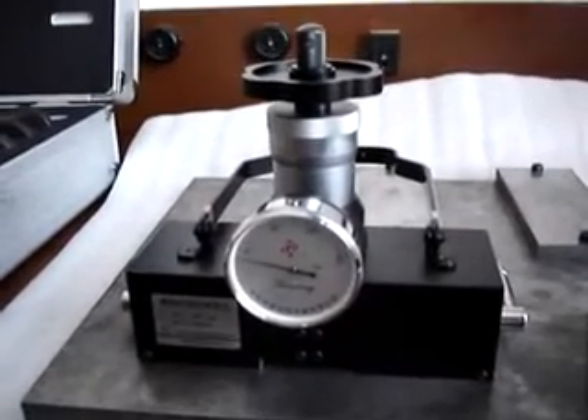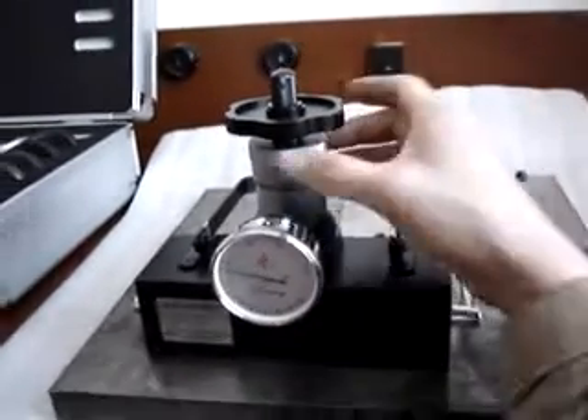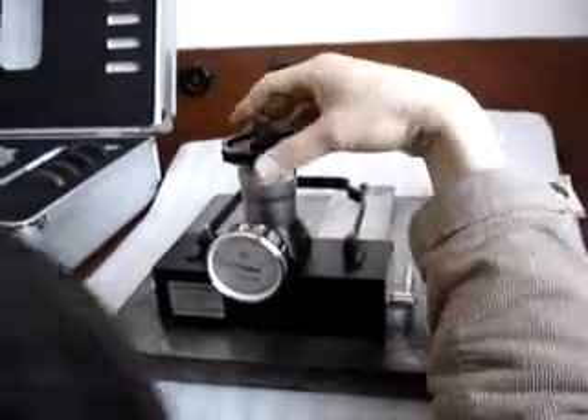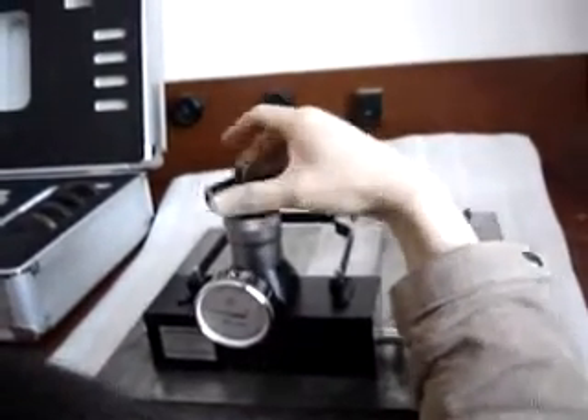And then, apply the initial test force. Rotate the hand wheel clockwise to bring the indicator hand to the initial test force — for example, 10 kg.